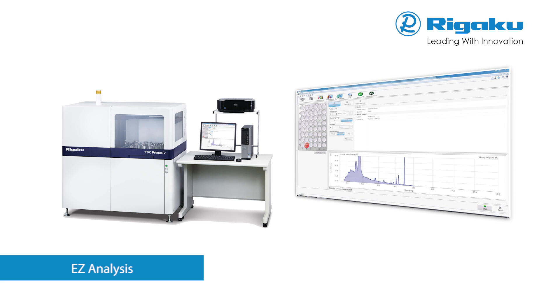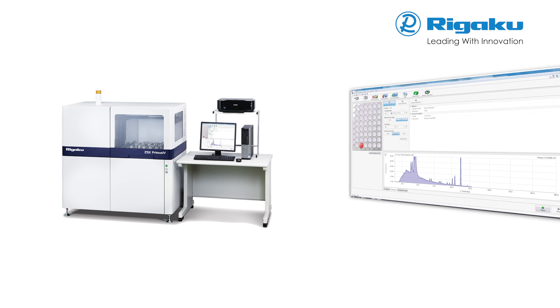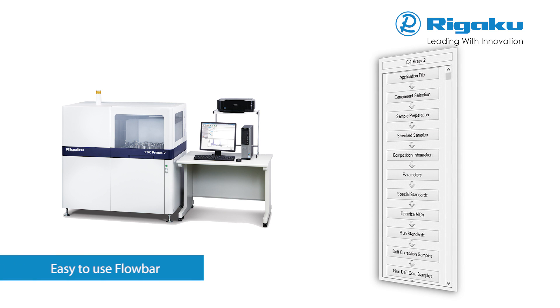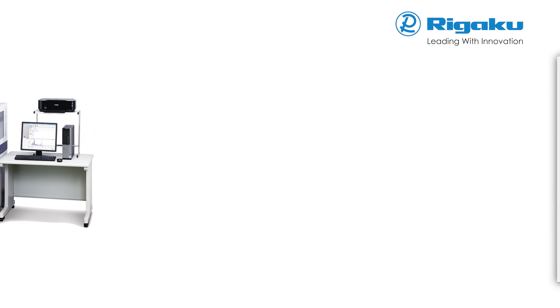A single interface contains everything you need to know about the status of your samples, what your data measurement parameters are, and a running output of your results. Based on the Rigaku easy-to-use flow bar interface, ZSX software walks the user through the steps required to set up either an empirical or a fundamental parameters application.